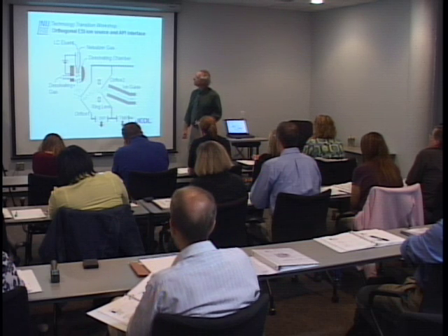I've got to hand it to the guys in Japan who designed this. It's a very simple and robust ion source. There are a lot more complicated atmospheric pressure interfaces out there. Some systems use a heated capillary, and that works, but it tends to get contaminated. It's much harder to clean. So if you're going to work with real-life samples, which is the real beauty of DART, it's nice to have something that tolerates abuse.